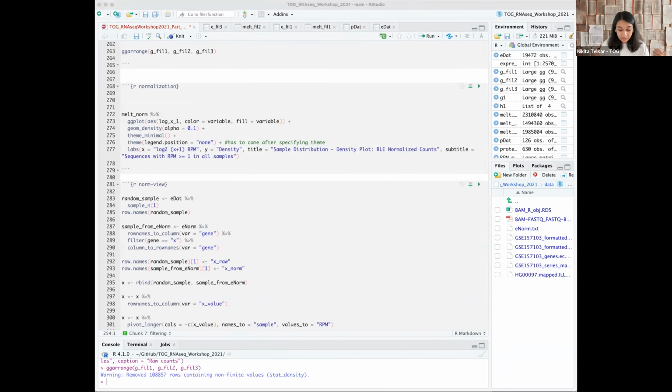Normalization, if you work with data, means that you're scaling all of your expression counts so that they're comparable across each other. Okay, I'm just going to paste this because I'll explain it step by step, but sometimes the notebook takes a little bit of time to load.